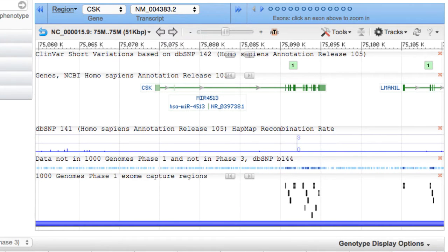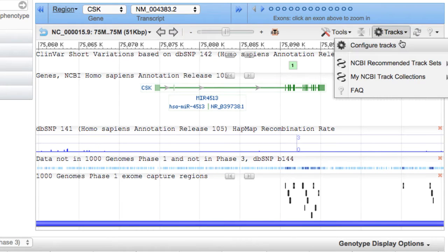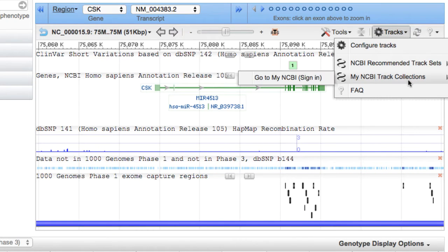Now if I want to save this new set of tracks, I must be logged into My NCBI, or first register for a free account. You can log in via the Tracks menu, or the link at the top right of any NCBI page. I'll use the Tracks menu to log in.